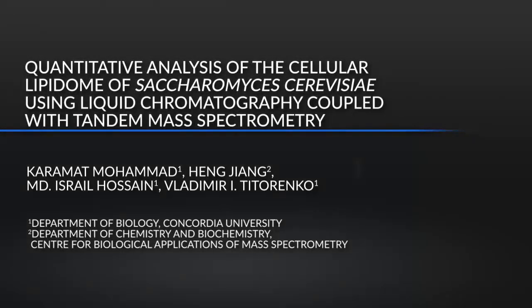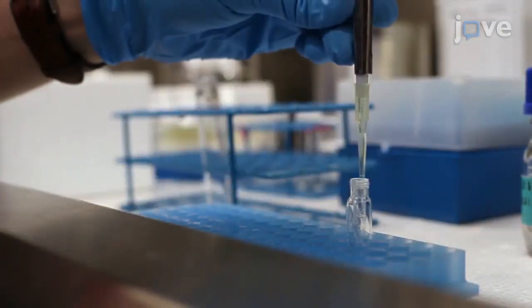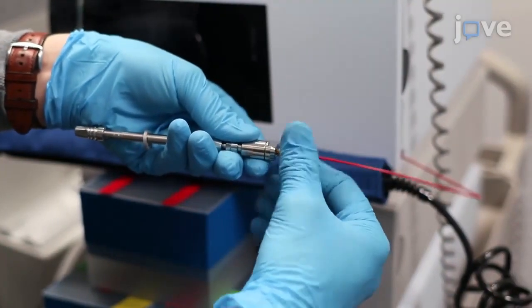This protocol provides an accurate and reproducible method for quantifying 10 different lipid classes of Saccharomyces cerevisiae using a single extraction method and a single LCMS method. This method allows the detection and quantification of isobaric and isomeric lipid species having different chemical and physical properties.